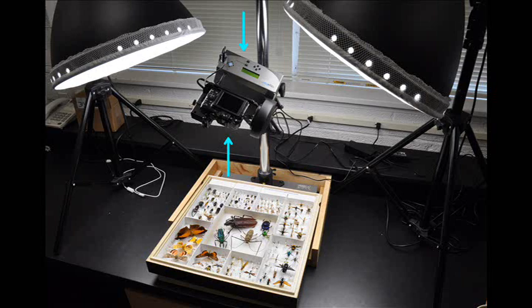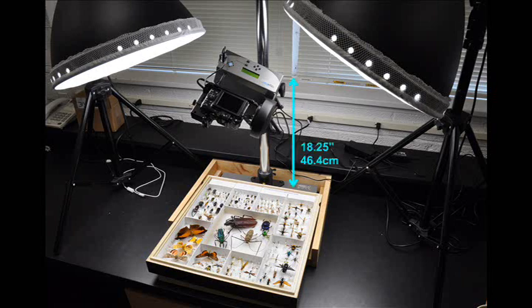For shooting most insect drawers, including California Academy, Cornell, and USNM styles, the entire unit should be positioned about 18 1⁄4 inches, or 46.4 cm, from the baseboard of the copy stand, measured from the robot's attachment threads. This allows for good resolution of different sized insects, while reducing distortion and curvature due to the pivoting action of the unit.